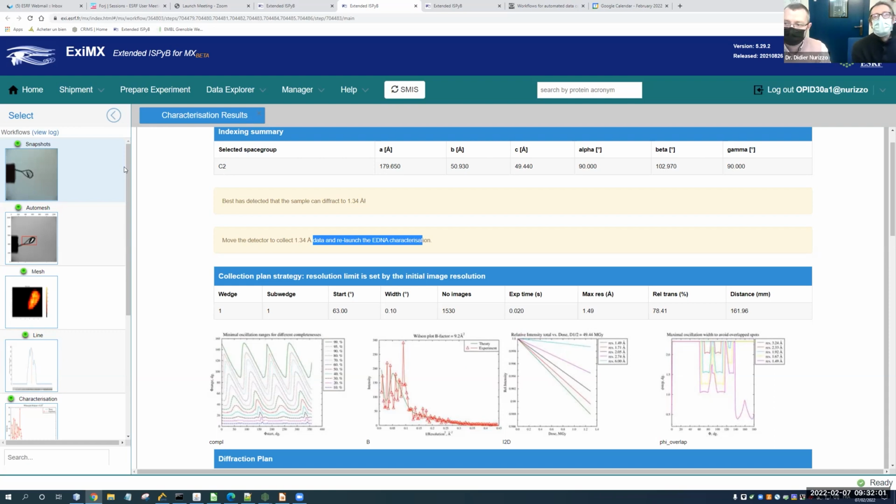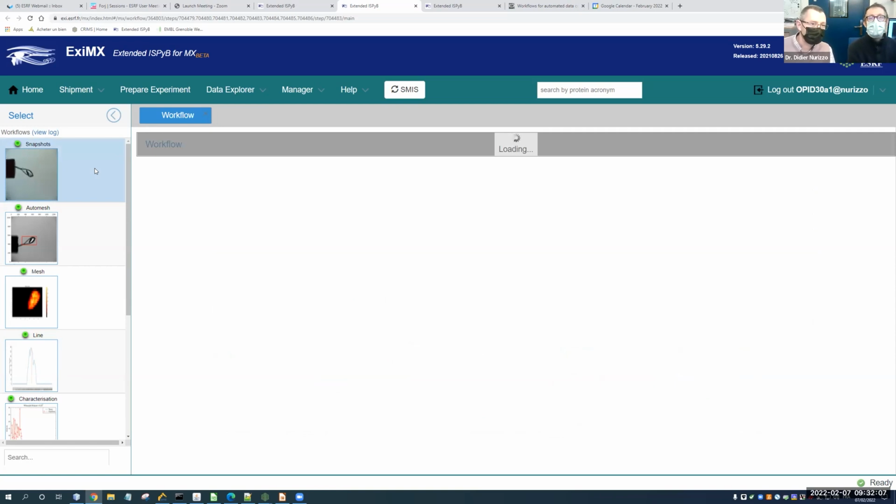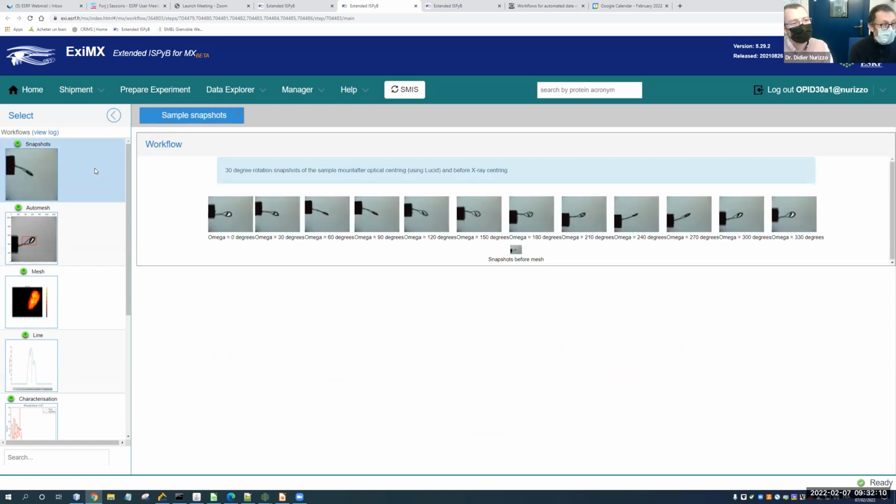Okay. So what does the beamline do on its own? We don't do anything, everything is done automatically. Obviously, if users don't come, it doesn't mean that we are here to do it, but the machine does it for us, which also means 6 days a week and 24 hours a day. So basically, first of all, we load the sample. We got a FLEX sample changer since the EBS, like all the other beamlines. So the sample changer mounts the sample on the diffractometer.